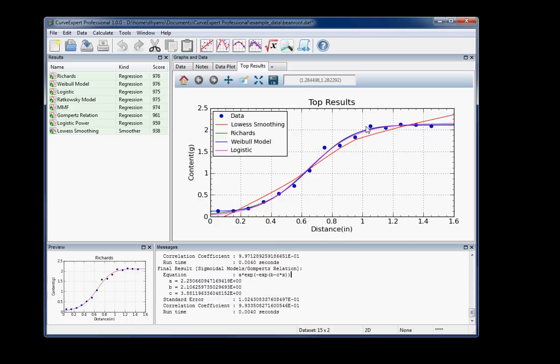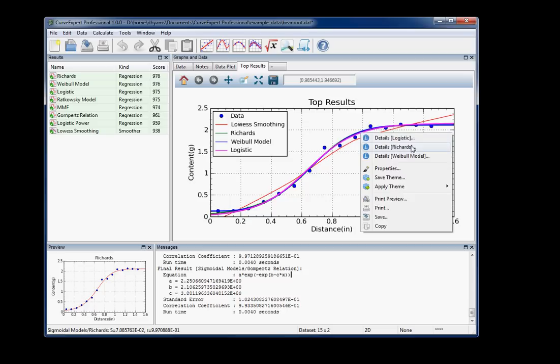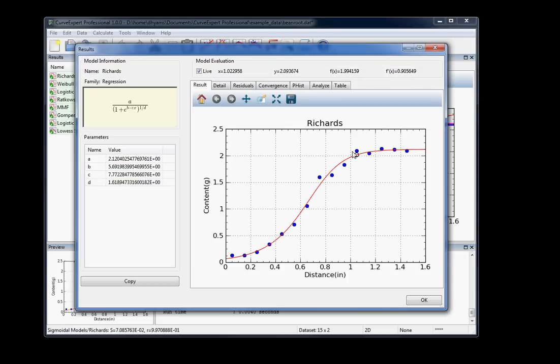And you can see the top results plot has become more populated as we point to each curve. It'll highlight, and you can do various things to those. If you double-click those, you can change the line styles and things like that. If you right-click and select Details, you can basically drill down a bit and show the details for that particular result.